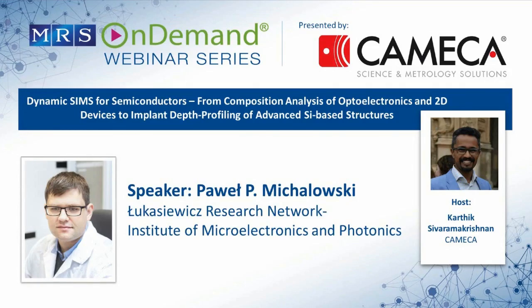Okay, thank you, Dr. Michałowski. And then one of our audience has said, thank you very much for your rich and pertinent presentation, and followed up with a question in terms of how you can use certain ion probes and how they affect the persistence of the artifacts that you identified in dynamic SIMS.